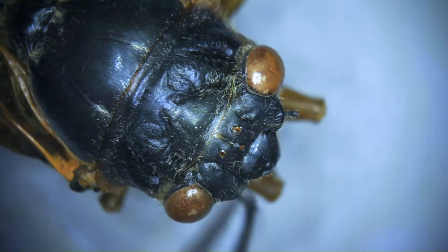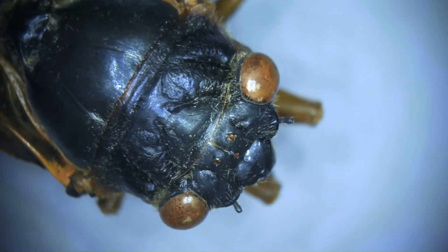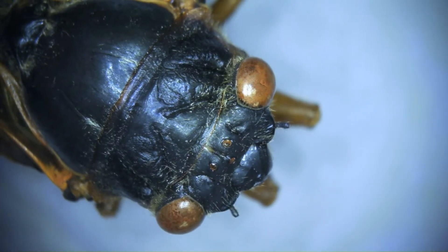Those three dots kind of pick up on light and extra movement to help them navigate around, beyond what their eyes can do — so that's what that is. Insects or true bugs also have cute little antennae; some are bigger than others, but here we can see these adorable little nubbins on the front of their head.